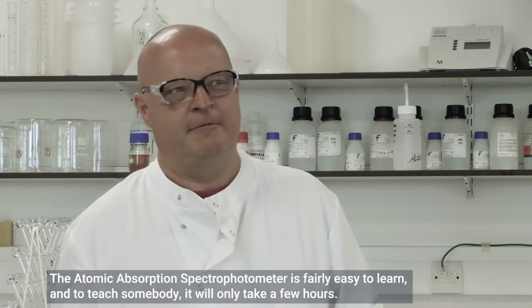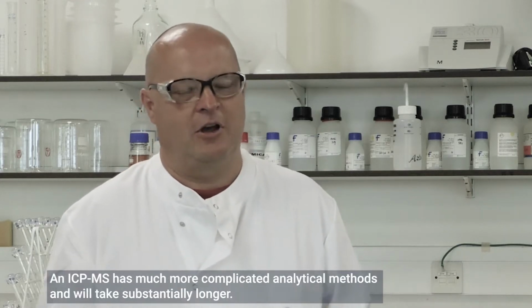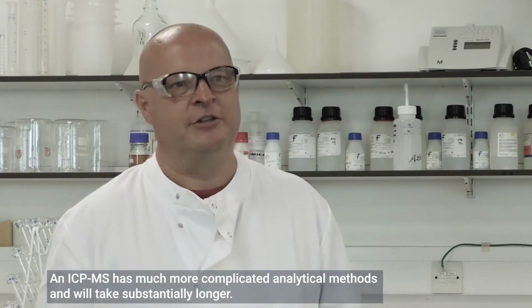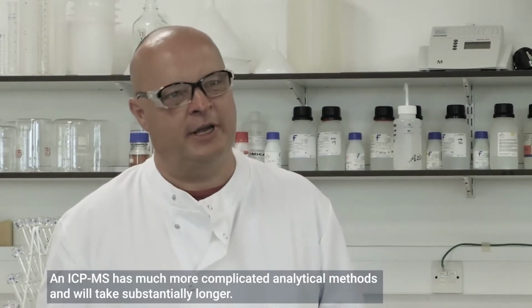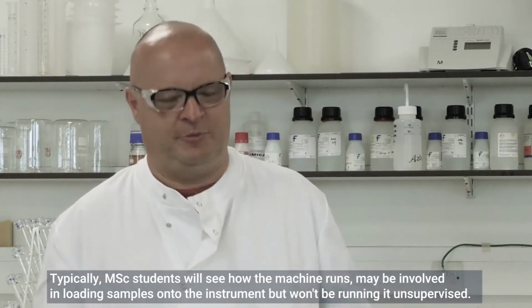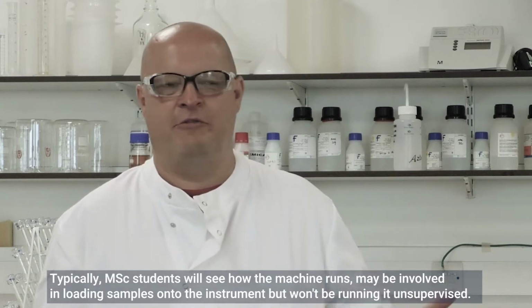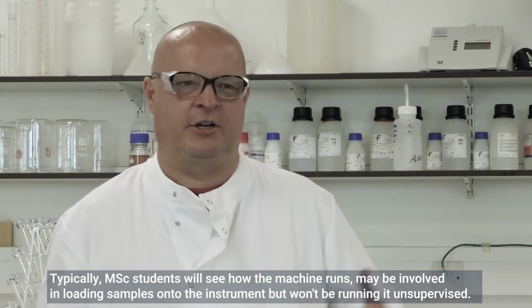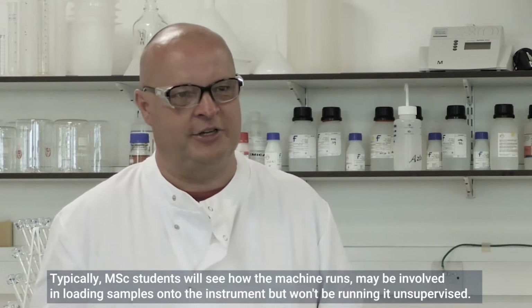It will only take a few hours. ICP-MS is a much more complicated analytical method and will take substantially longer. So typically maybe MSc students will see how the machine runs, may be involved in loading the instrument for doing analysis, but typically won't be running it unsupervised.